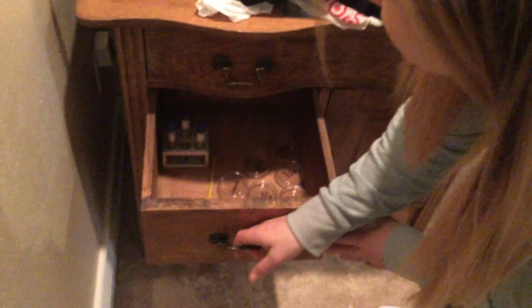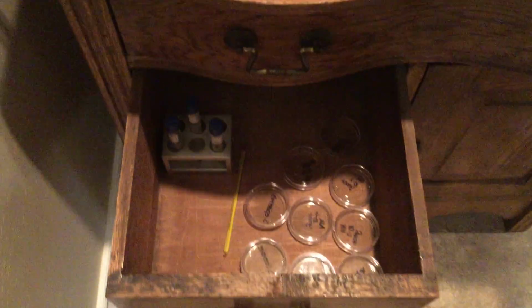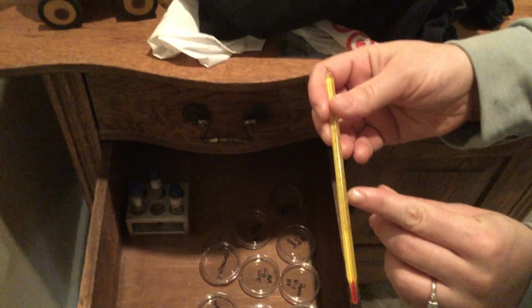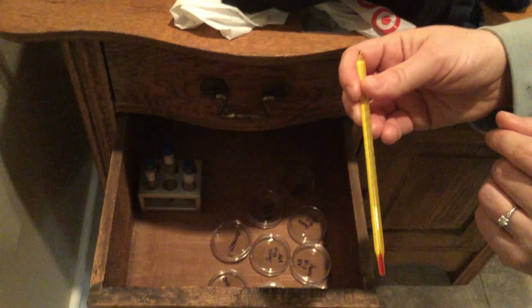As you can see, I chose here, like I said, I already kind of started for next week's lab, so some of my stuff is already incubating right now. And then I just checked the thermometer to make sure it was above 20, and here it's at 23 degrees Celsius. That pretty much wraps it up for this week.